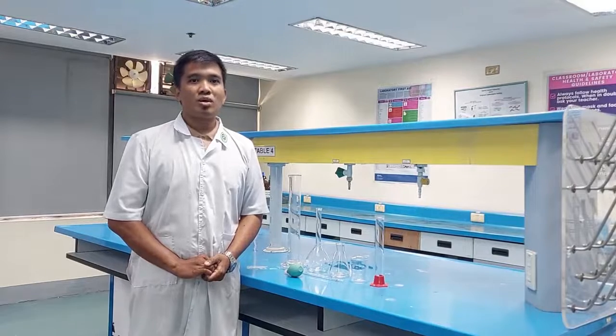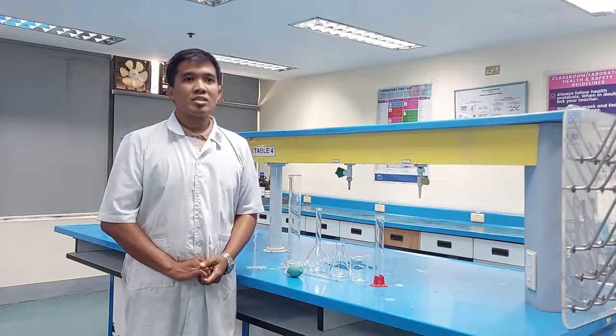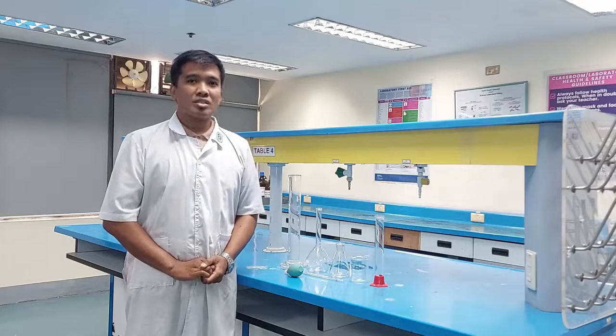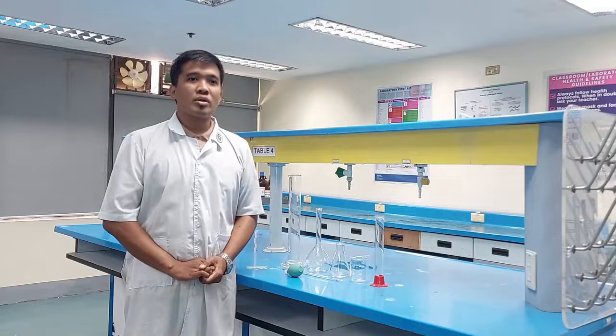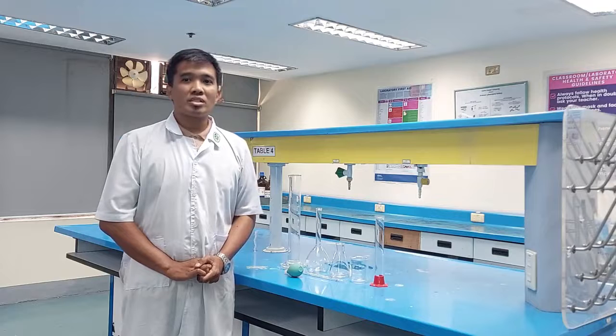The measured volume corresponds to the volume of liquid contained in the cylinder. Hence, the graduated cylinder and glassware like volumetric flask, Erlenmeyer flask, and beaker are classified as contained glassware. The volume of liquid in a graduated cylinder is obtained directly by reading the calibrated scale.